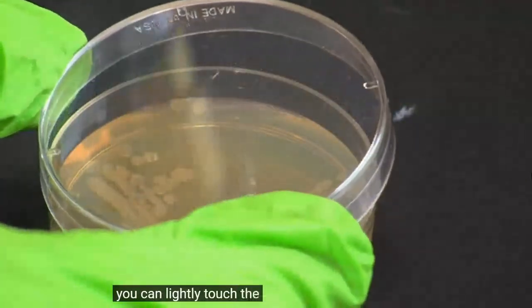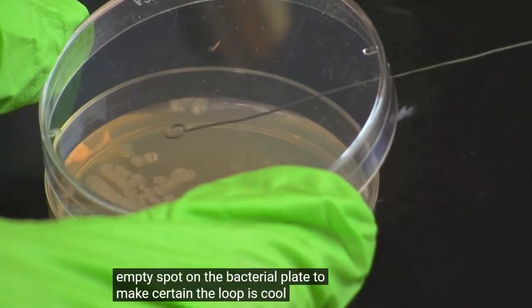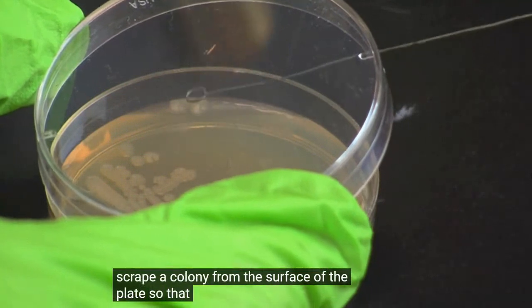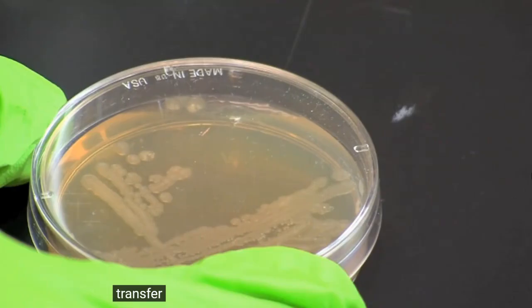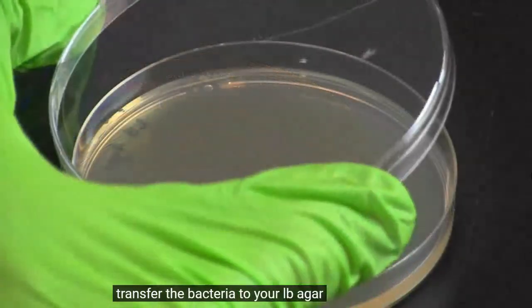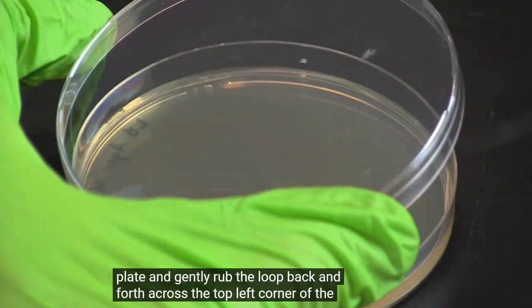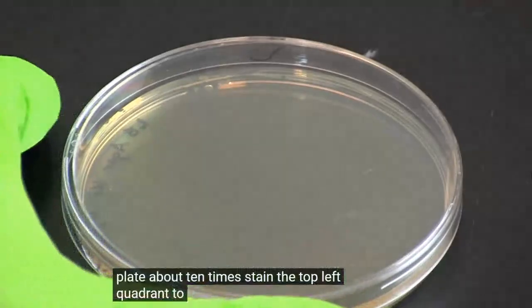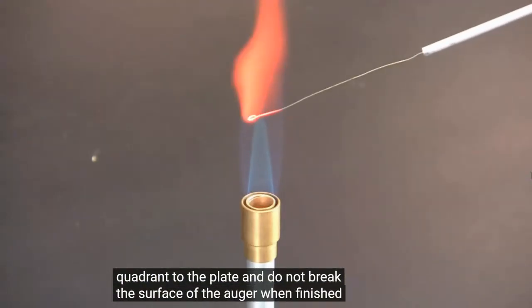You can lightly touch the loop on an empty spot on the bacterial plate to make certain the loop is cool. Gently scrape a colony from the surface of the plate so that it collects on the loop. Transfer the bacteria to your LB agar plate and gently rub the loop back and forth across the top left corner of the plate about 10 times. Stay in the top left quadrant of the plate and do not break the surface of the agar. When finished, flame the loop.